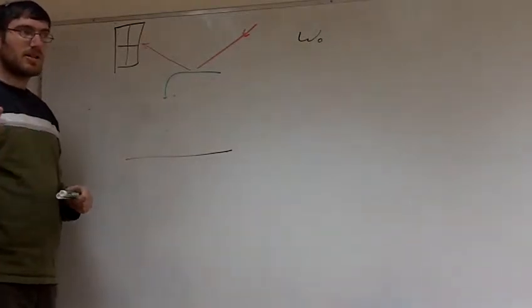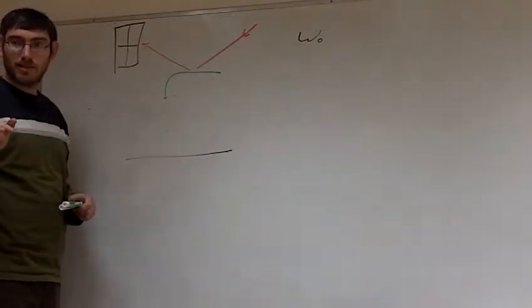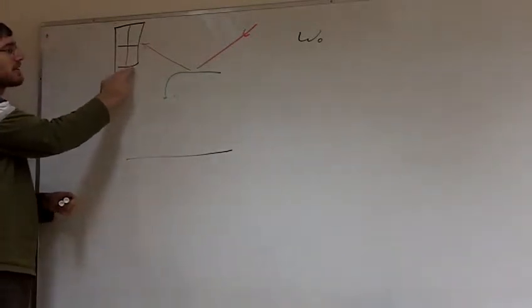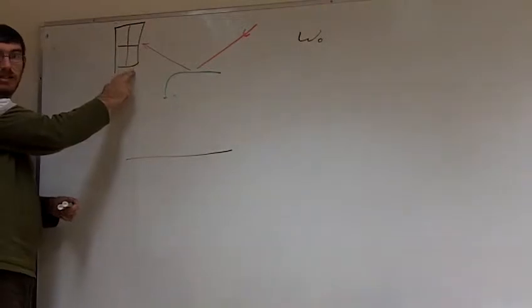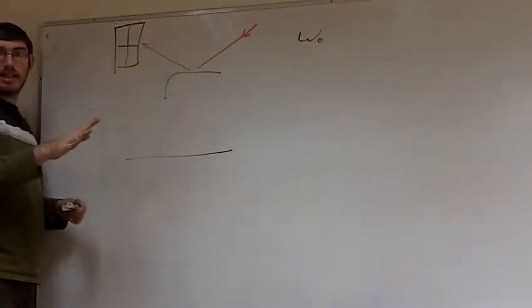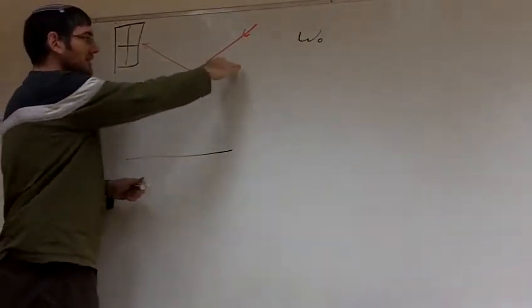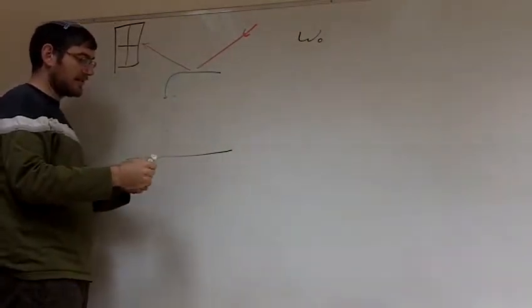No. Okay, so you're going into the tuning fork already. We're talking about the MV1000. Our detection is always with the PSD. This is our detector. The piezo doesn't work as a detector. The piezo is only an initiator. Well, it's the only one which is, there's a PZT here, a piezo.